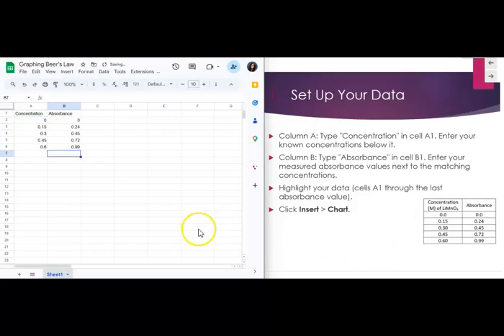All right. We always want to go back and double check to make sure that we have correctly inputted our data. Sometimes we'll think we typed something in and we'll make a mistake, and that's going to have a really big impact on our graph. You'll also notice that there are more significant figures in our data than there are on our graph. Like I have here 0.30, but here it just says 0.3. That's totally fine. It's not really a big deal.